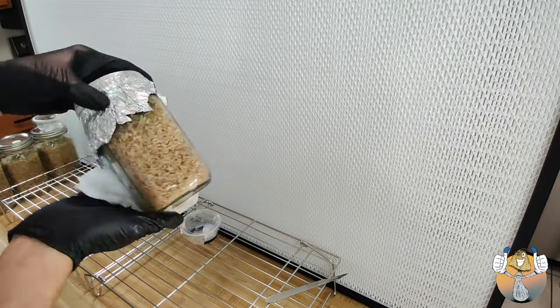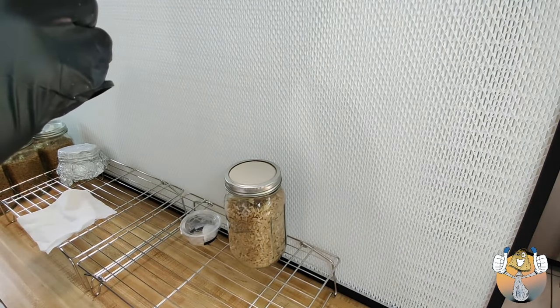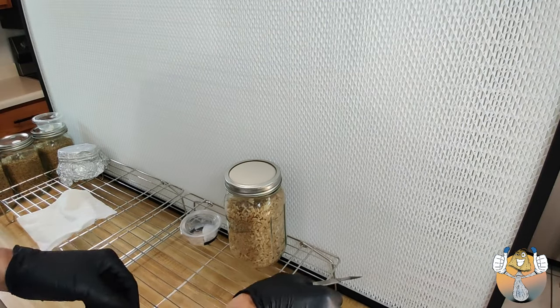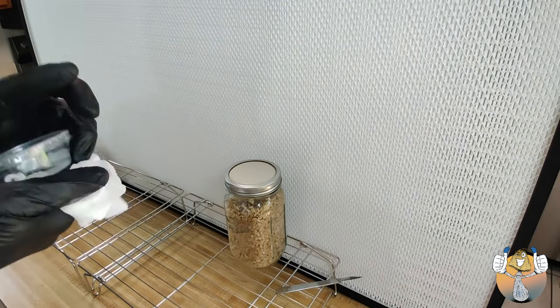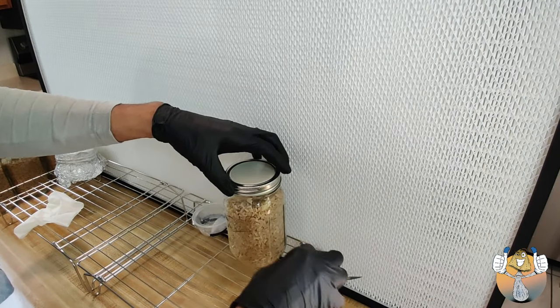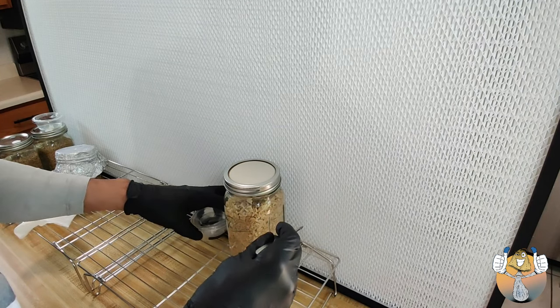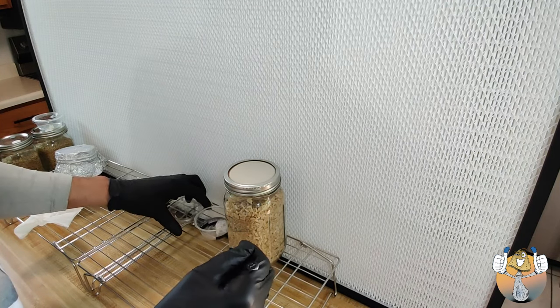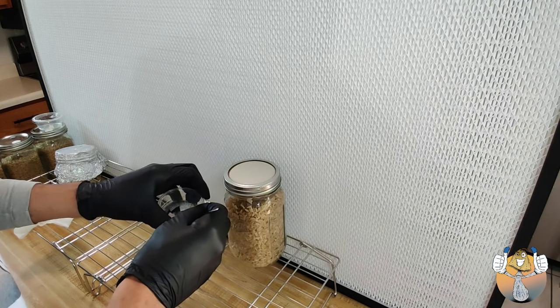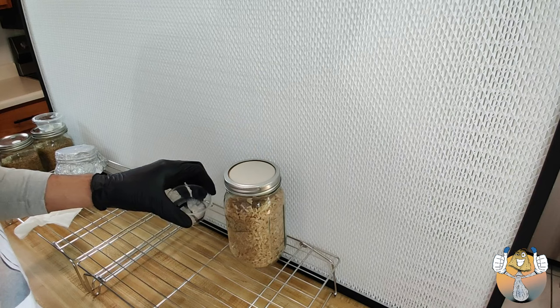Last but not least, we have our unmodified jar. I'm going to go ahead and wipe that down. Now the jar is fully sealed right now, so we'll pop the top just as normal. And we're going to make our normal pizza slice cut in our agar. And this one had a little mushroom growing out of it.